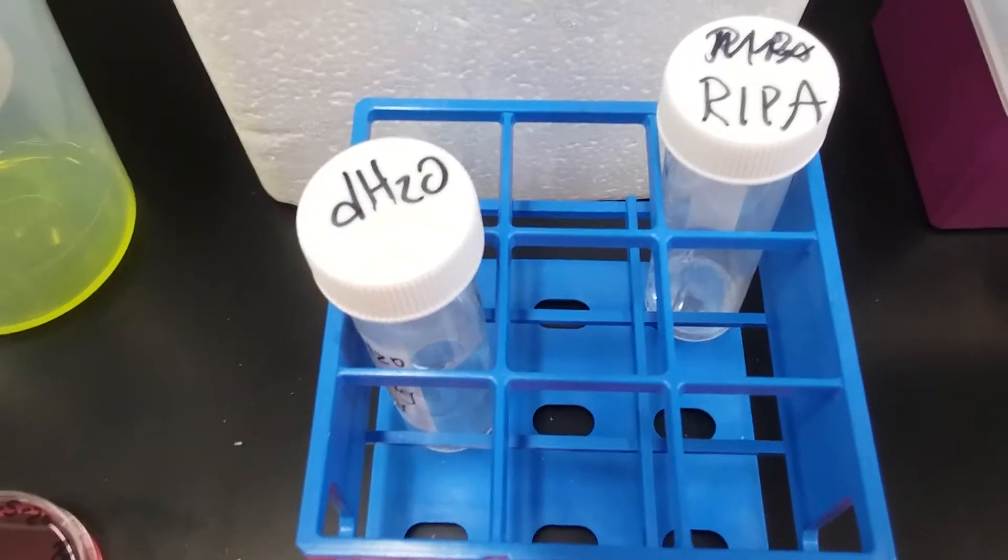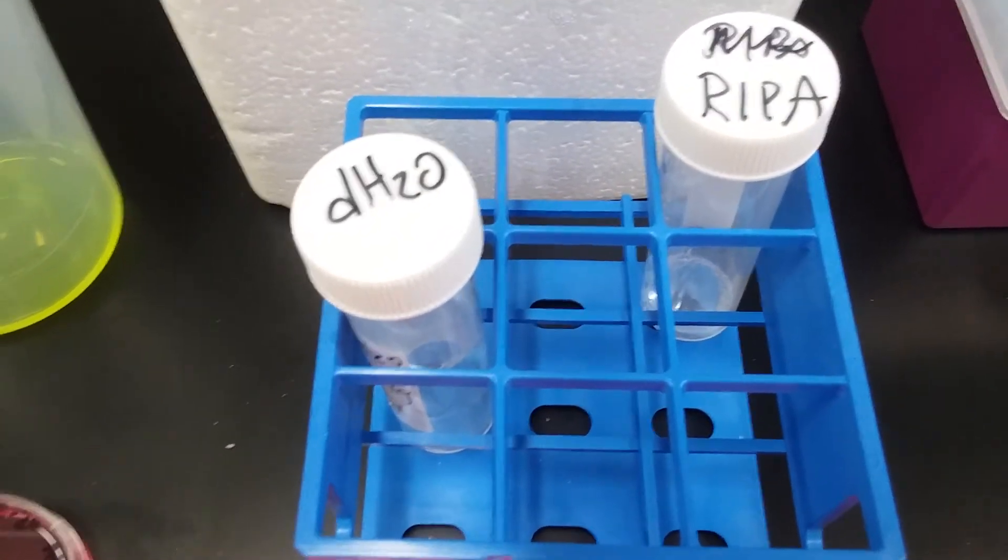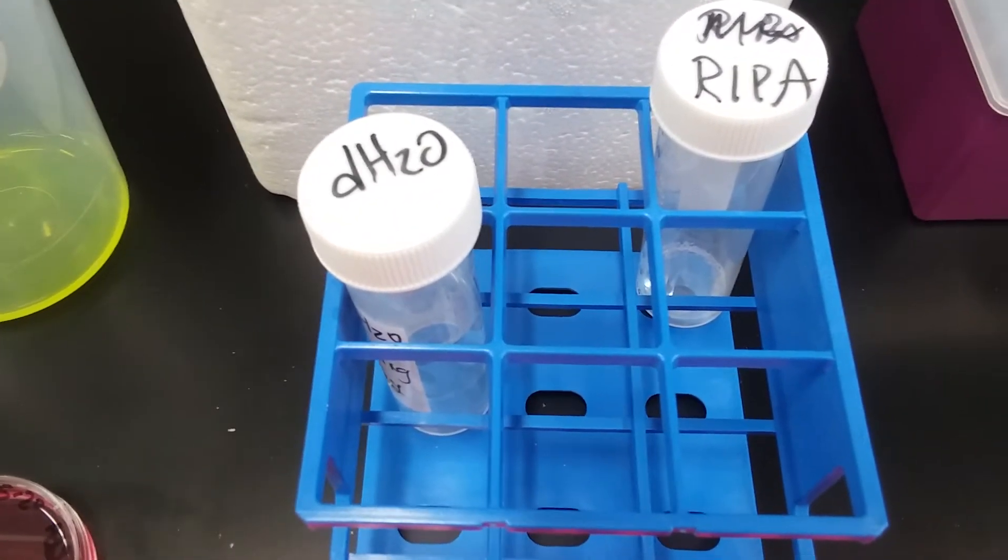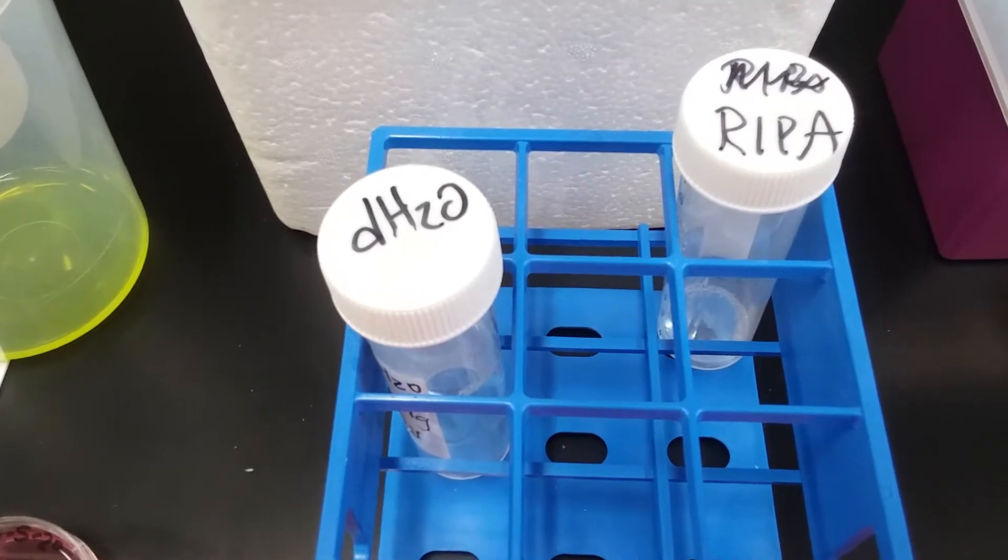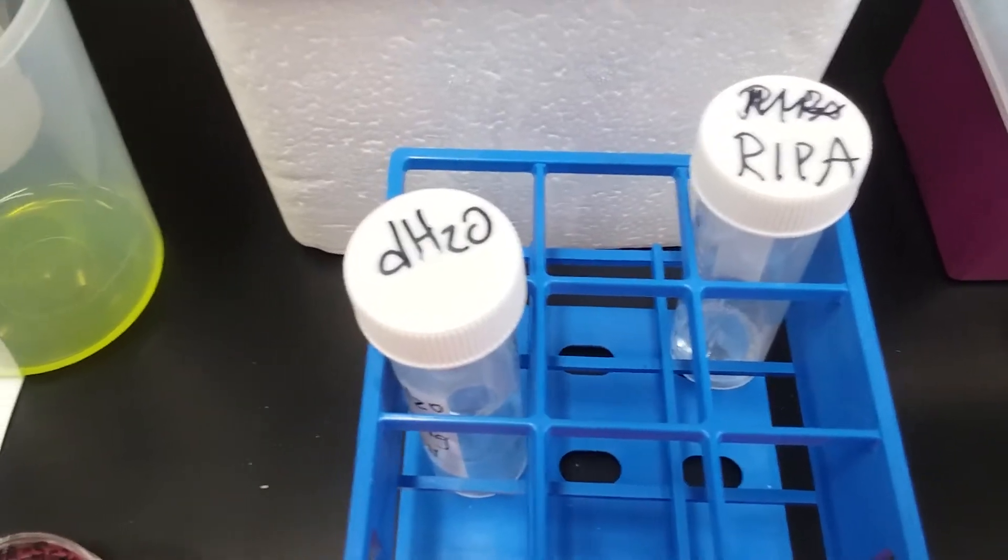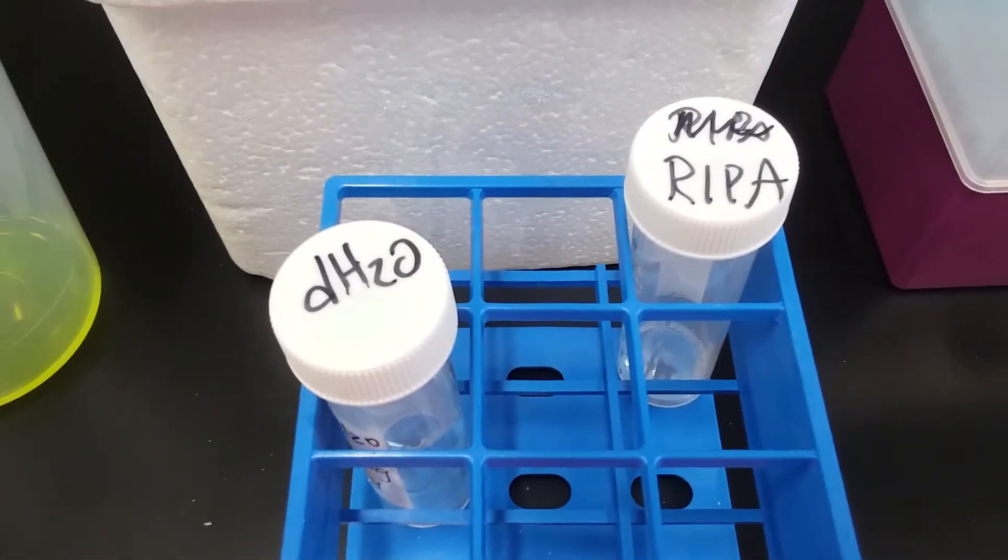So I liquid transferred 150 microliters of Tris, 30 microliters of SDS, 750 microliters of deoxycholic acid, 450 microliters of sodium chloride, and 30 microliters of Triton into the RIPA.